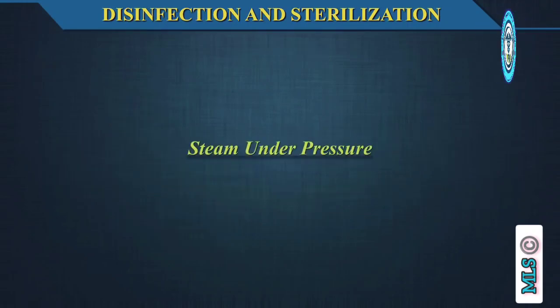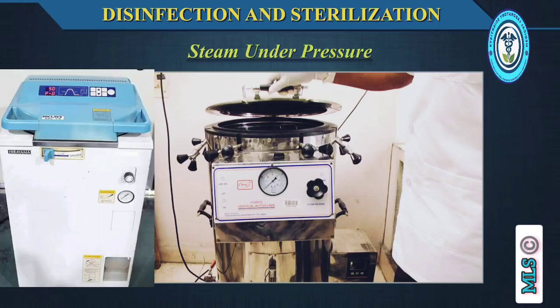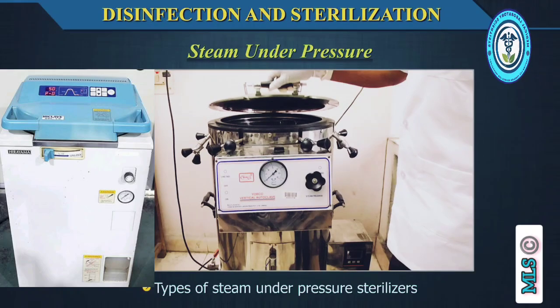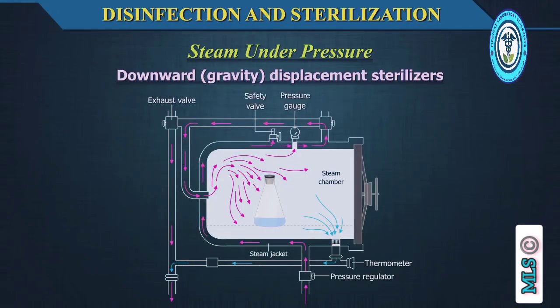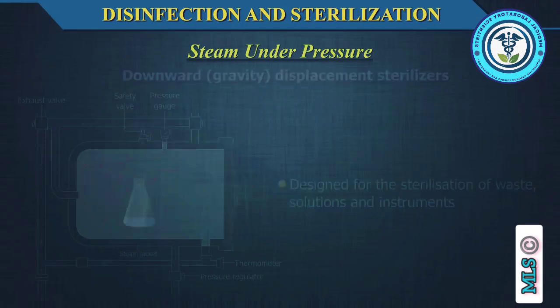Steam under pressure, moist heat sterilization. This is the most efficient and reliable method to achieve sterility of instruments and equipment. It is inexpensive, non-toxic, and very reliable. There are several types of steam under pressure sterilizers, also called autoclaves: downward gravity displacement sterilizers, jacketed and non-jacketed. These are designed for sterilization of waste, solutions, and instruments.